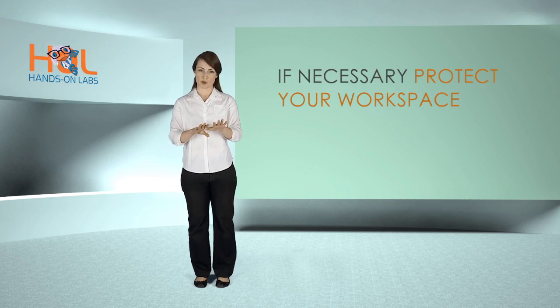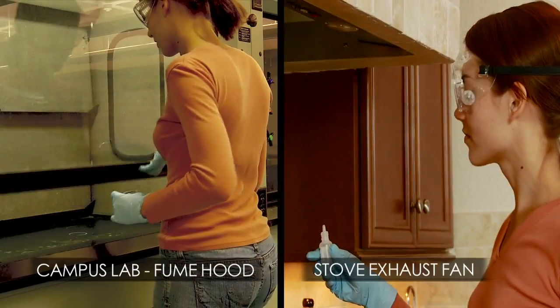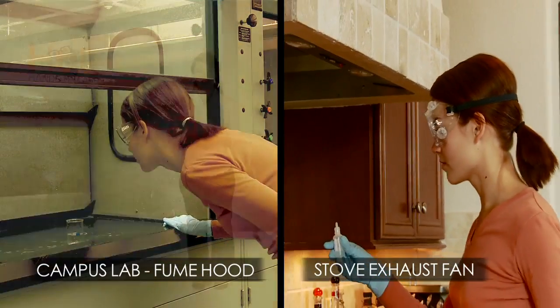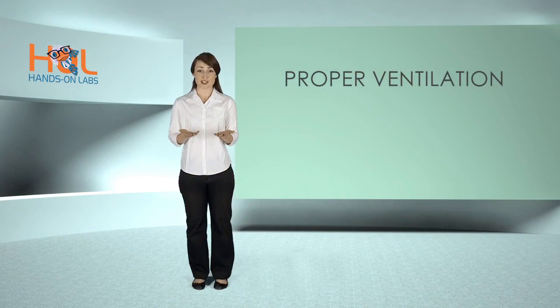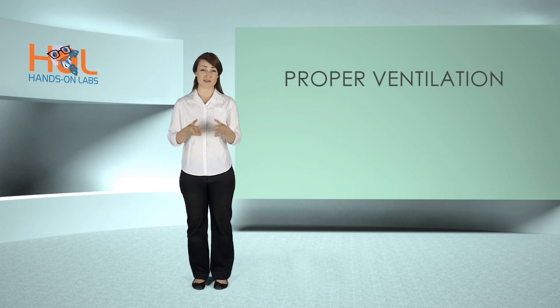Protect your work table or surface by covering it with plastic sheeting or a white garbage bag. An open window or stove exhaust fan are adequate to provide proper ventilation. Certain chemicals have noxious fumes that can be dangerous if inhaled in sufficient quantities, and flammable vapors can become explosive if allowed to accumulate in an enclosed space.